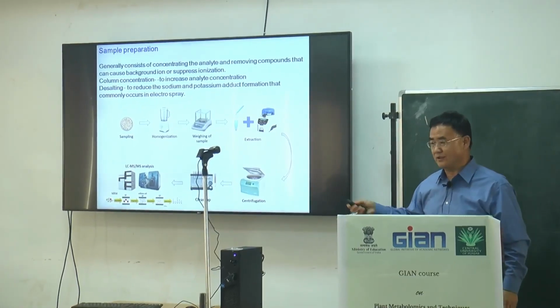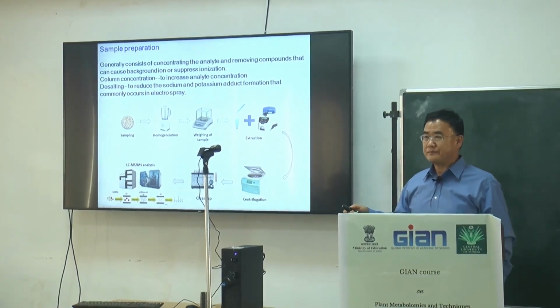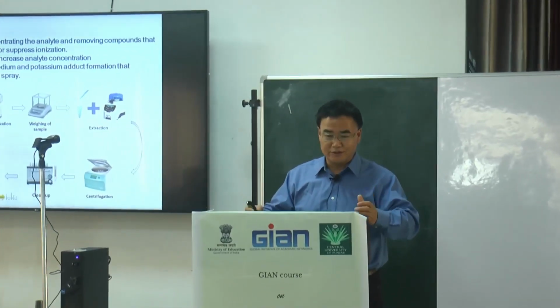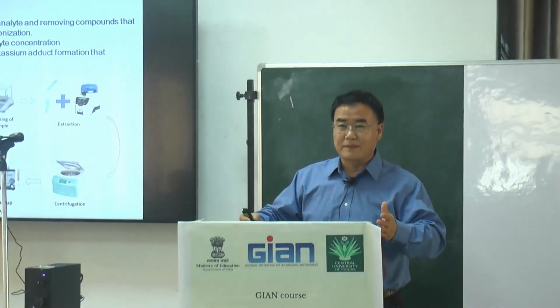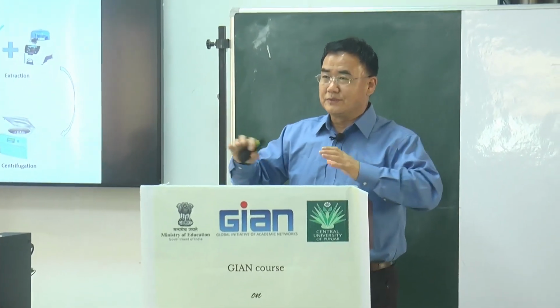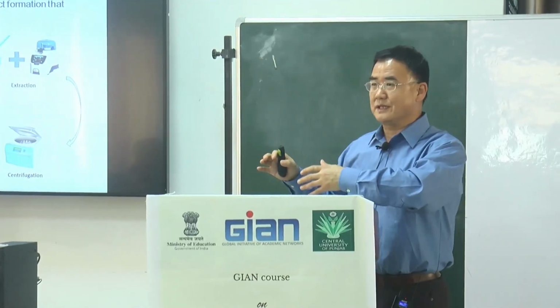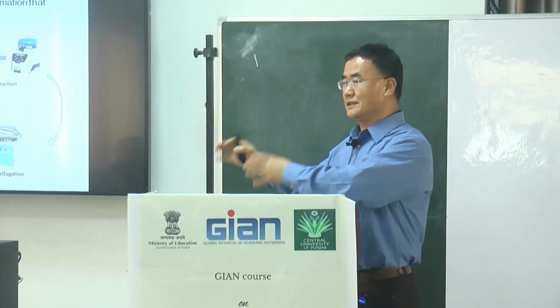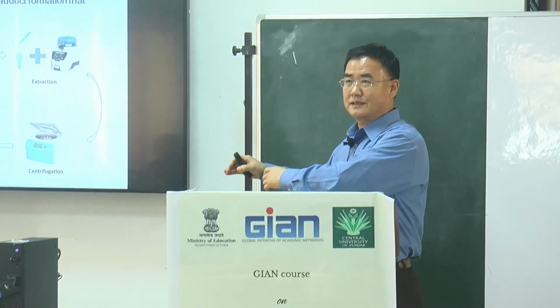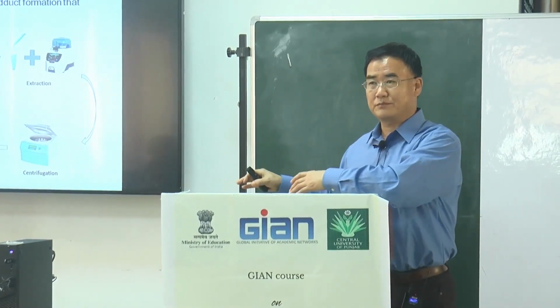Later I will continue to talk about this. Almost every class I will continue to talk about LCMS and GCMS. It's not exclusive. I don't talk about LCMS only in the application of LCMS in plant metabolomics.